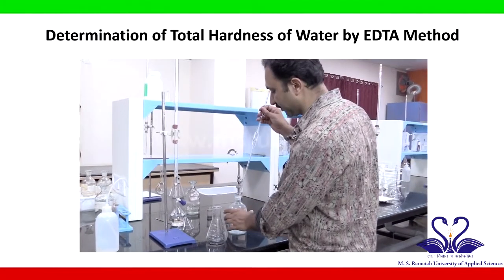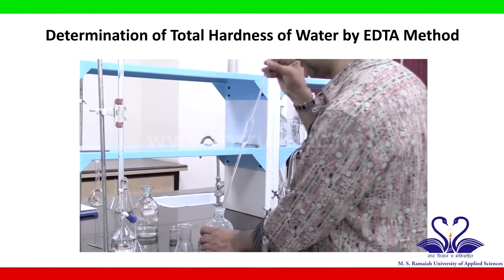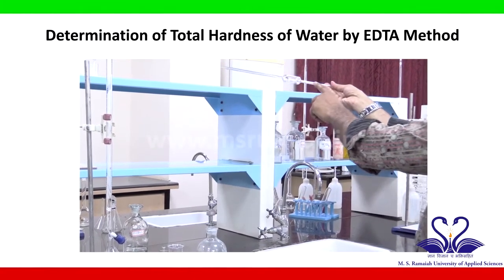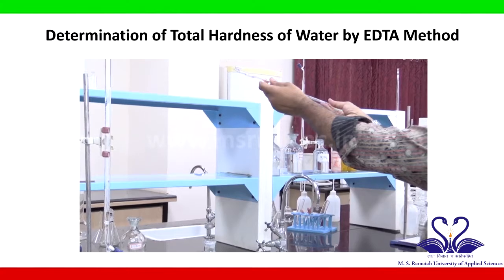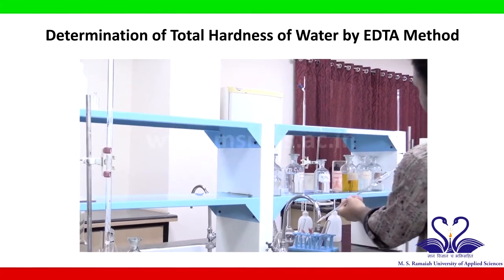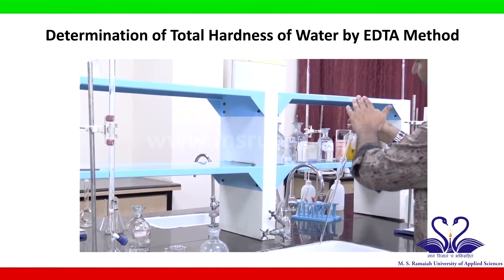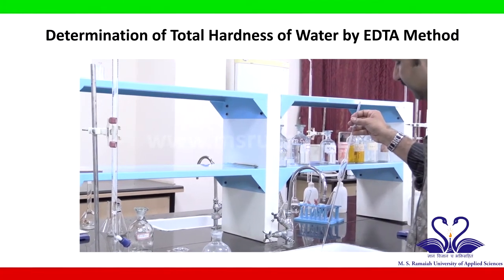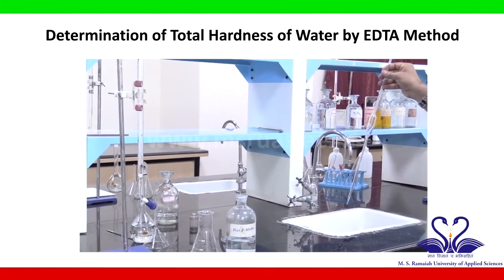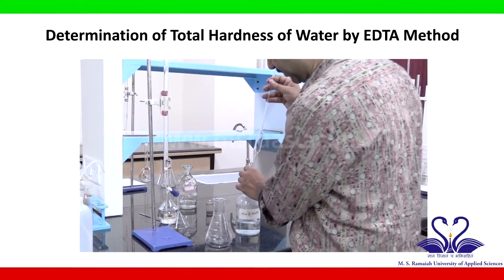So whose hardness you are going to determine. Rinsing means taking 50% of it. So you should be going up to the mark. Slowly you can see up to the mark, and then rinse it thoroughly, and then make it fall down only on this side. So this side we should not leave the solutions. Pipette is rinsed.